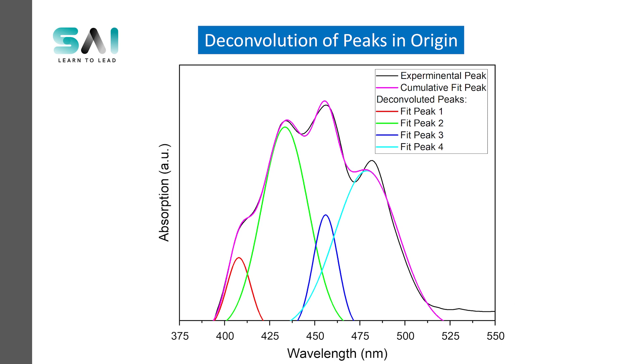In today's video we are going to learn how we can deconvolute the peaks using Origin.